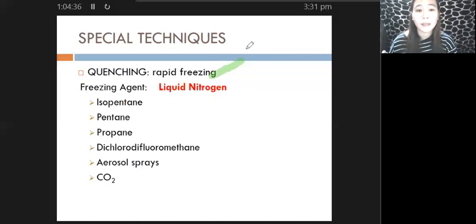involves the use of your liquid nitrogen, because again, it is the most rapid freezing agent. Okay. So other freezing agents that can be used, we have your isopentane, pentane, propane, dichlorodifluoromethane, your aerosol sprays, and of course, we have your carbon dioxide.